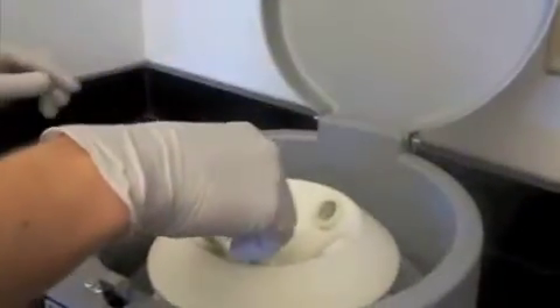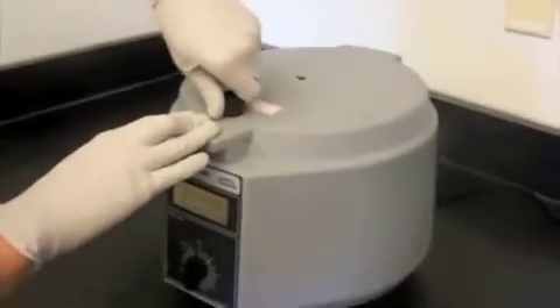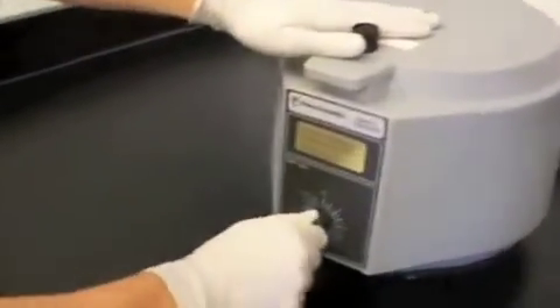You want to make sure you put the tubes directly opposite each other. Then secure the top, and set it for however long you want it to spin.